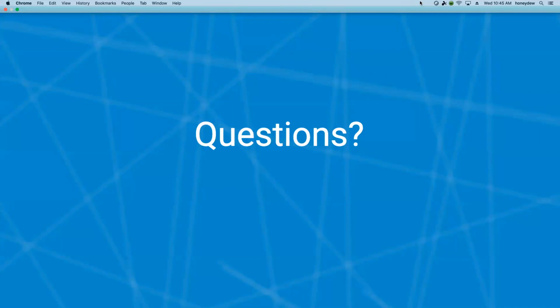And a couple more questions here as we're wrapping up. How do I get my existing data into the system? So LabKey Sample Manager has really been built to make it easy for people to import data into the system. Of course, if there are certain migration services that are needed, depending on the size, that's a conversation that we can always have, but we don't anticipate many users having problems getting clean data into the system.